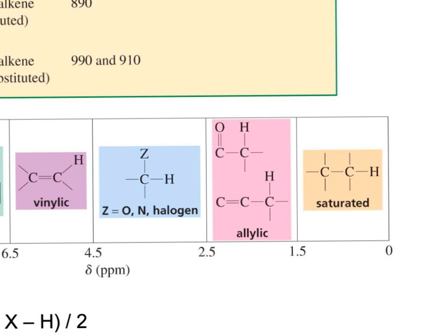So instead of halogen, pretend it's a fluorine. What's the difference between oxygen, nitrogen, and fluorine? Where are they relative to each other in the periodic table? You're working across a row, so what's the major factor? Electronegativity. So which one would you expect to be closer to 2.5? The nitrogen, the least electronegative one. So if this was nitrogen, we expect around 2.5. If it was oxygen, we'd expect around 3.5. If it's a halogen, like fluorine, chlorine, bromine, or iodine, we'd expect it more around 4.